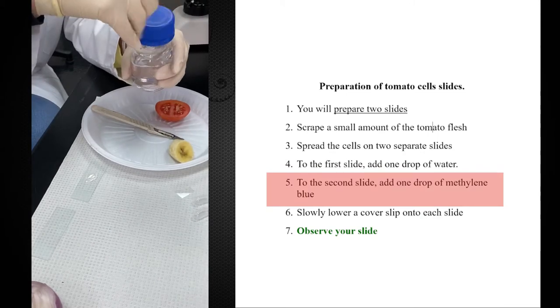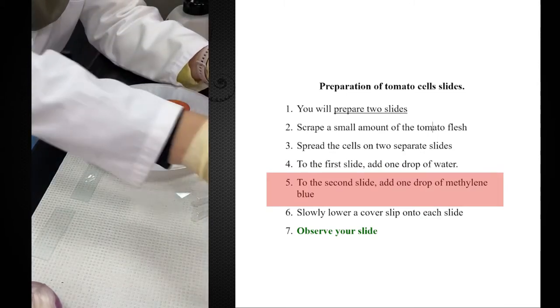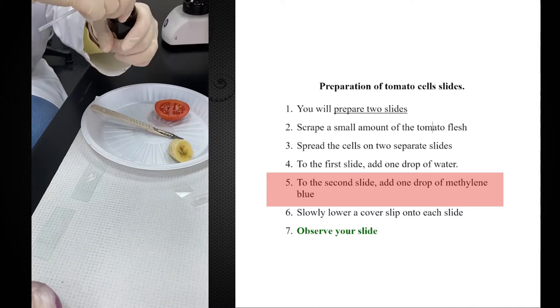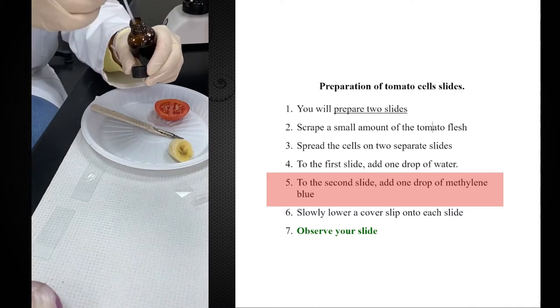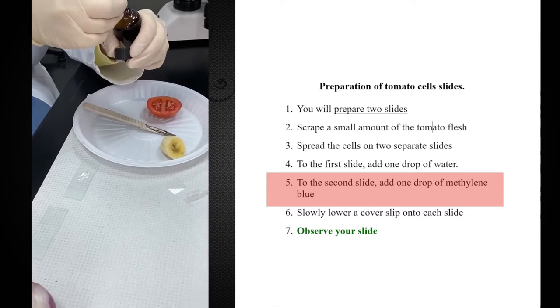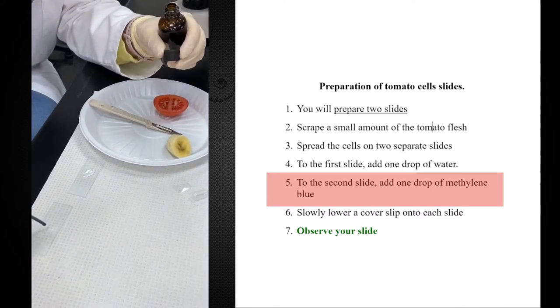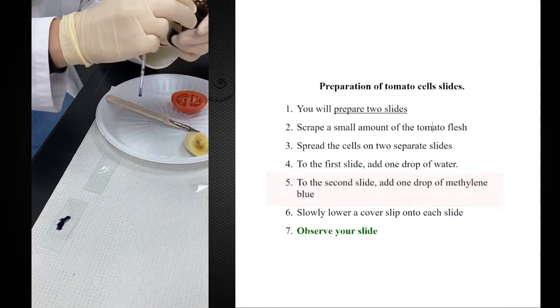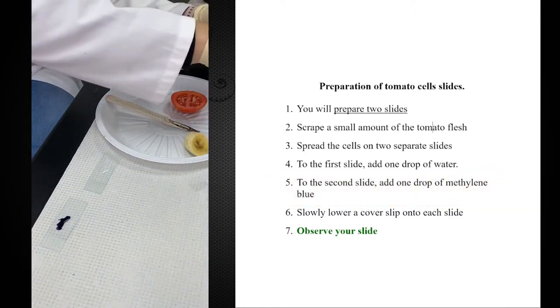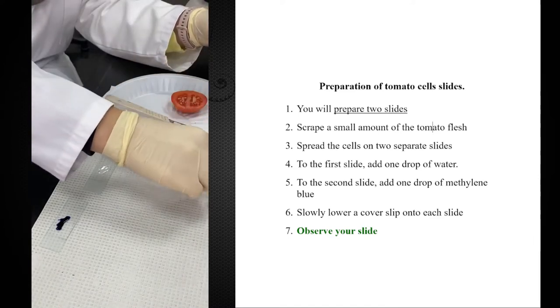You add two drops of methylene blue. So first slide was with two drops of water, second slide was with two drops of methylene blue.